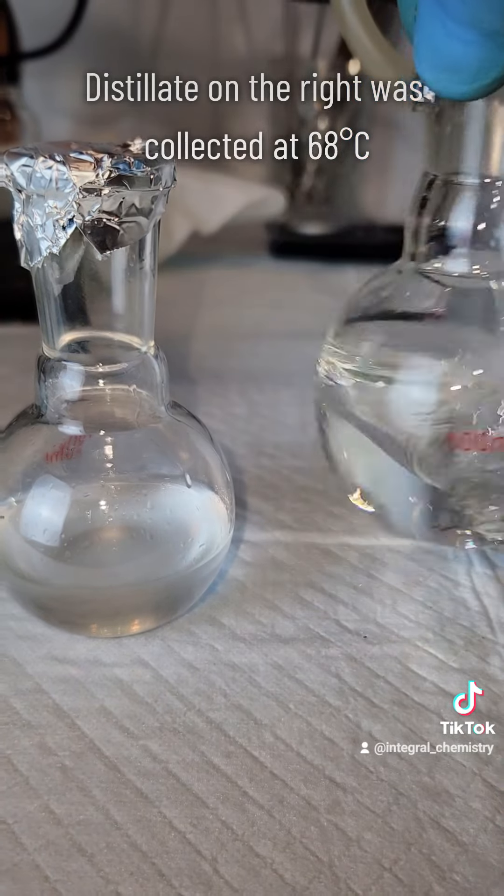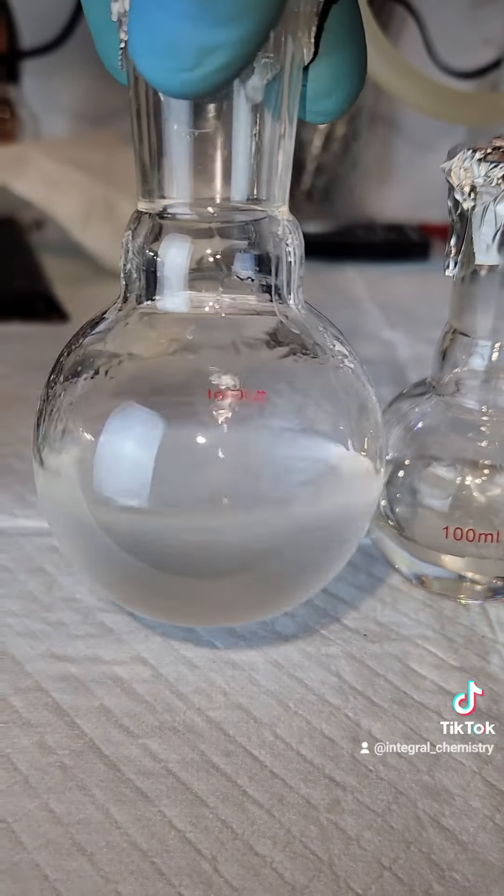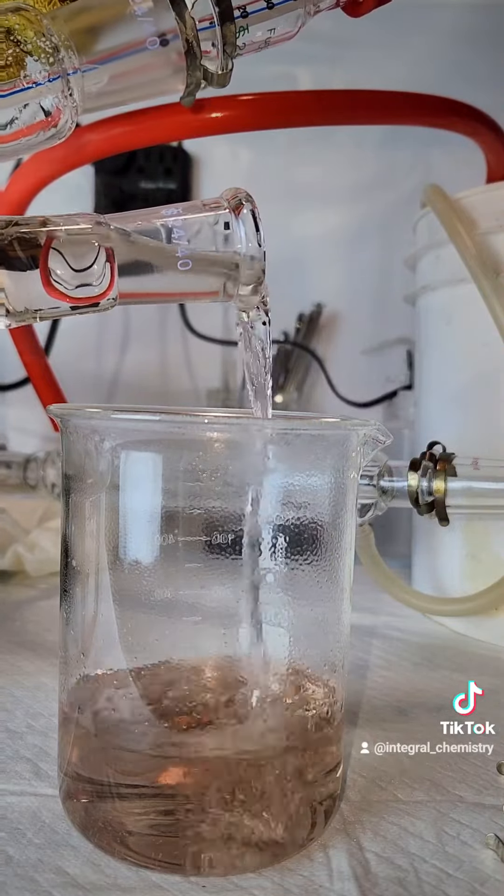Here you can see both of my collection flasks. The one on the right is everything that came over below 68°C — that one is definitely mostly chloroform, but it more than likely has a little bit of DCM in it, so I'm keeping it around.